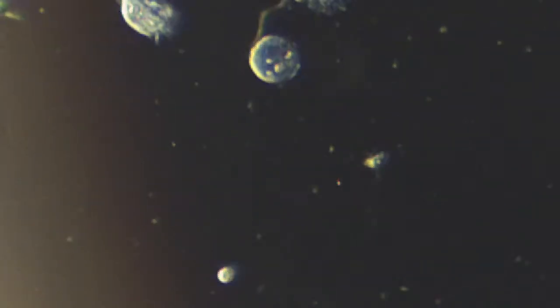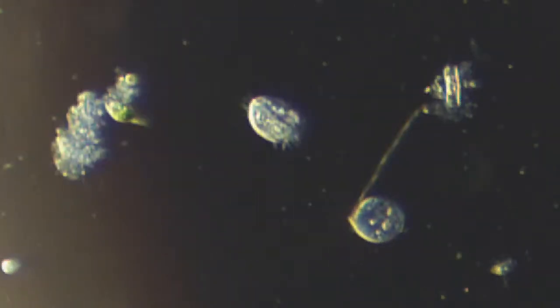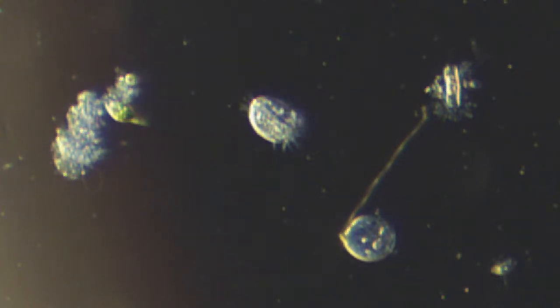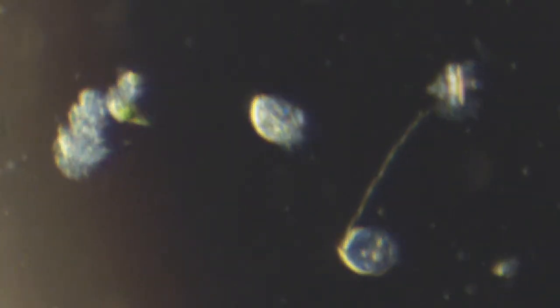So nice. There's another Vorticella on a little tiny piece of debris. And it's right next to a Euplotes, it looks like. Or is that a Euplotes or a Stylonychia? Let me get a little closer here. Actually, that's close enough. Just fix the focus.